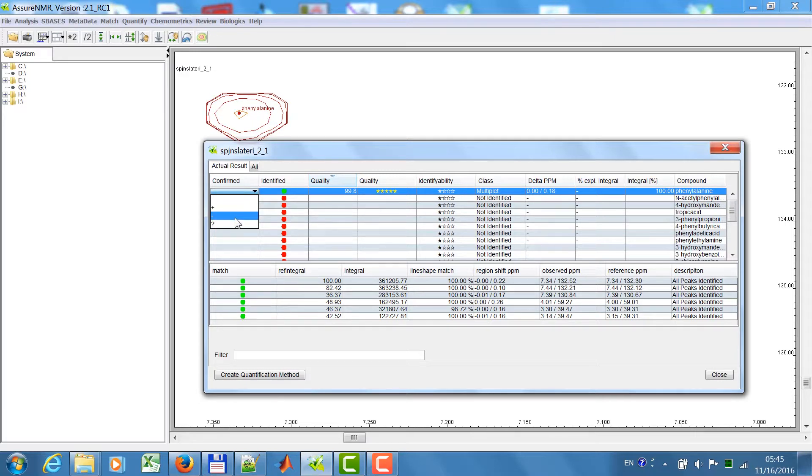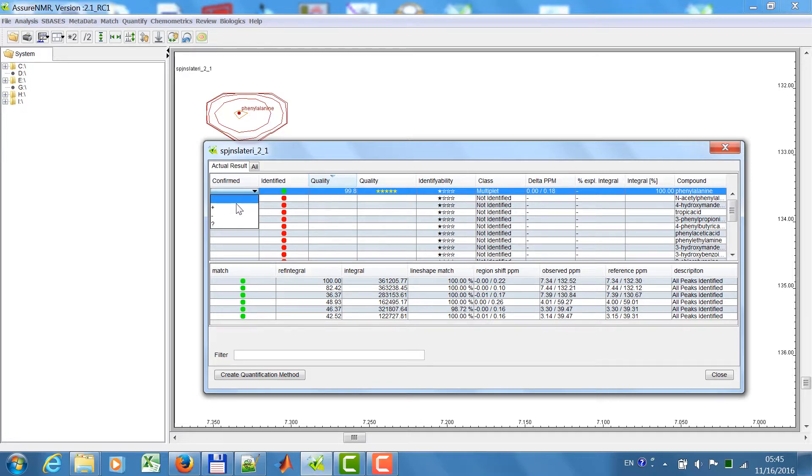But you can also say, no, I don't think it's there, or it's unclear to me, and empty means I did not have inspected this.